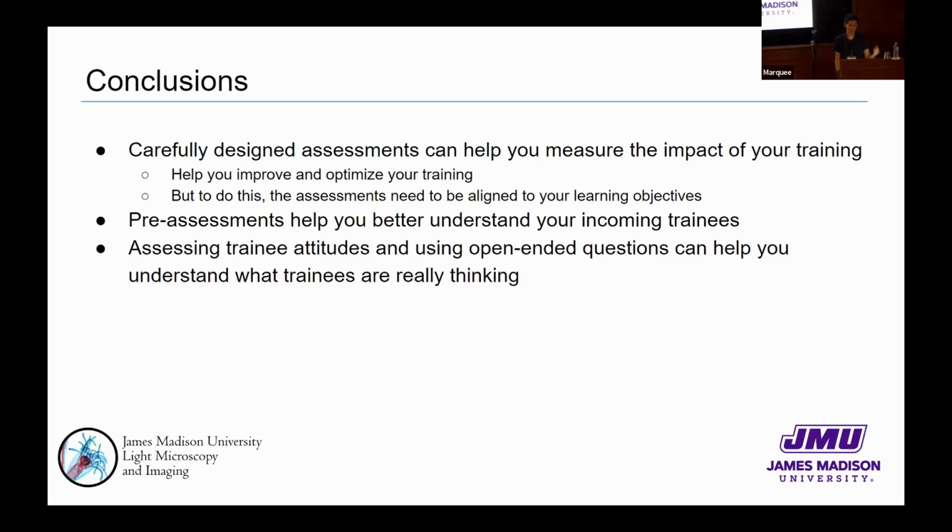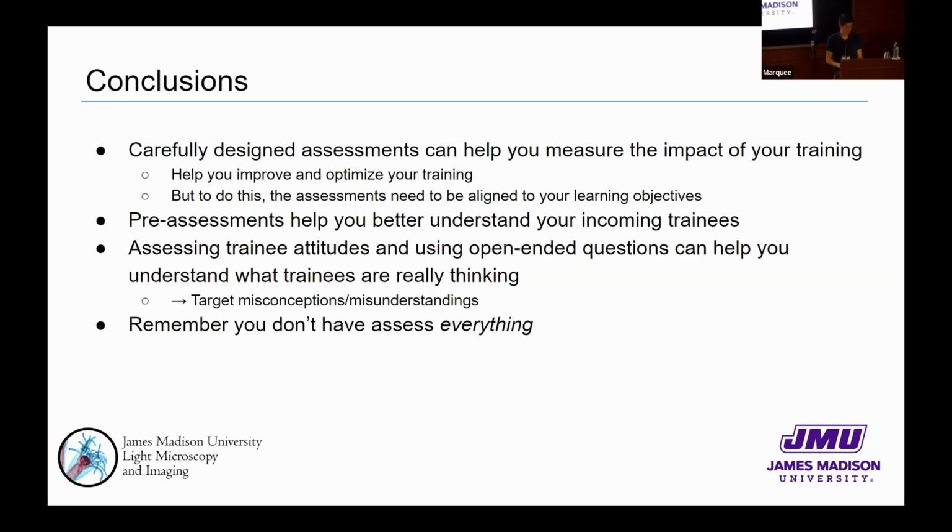And assessing trainee attitudes and using open-ended questions can help you to understand what the trainees are actually thinking, which can help you to target misconceptions and misunderstandings as well.